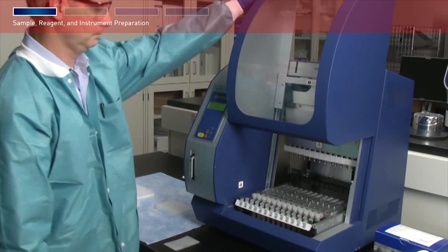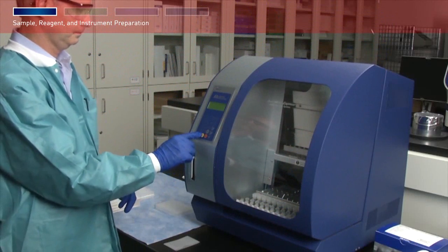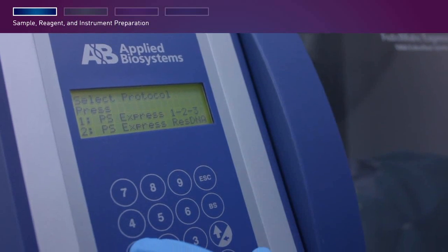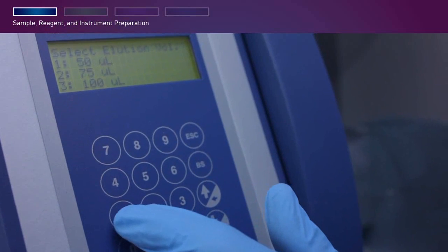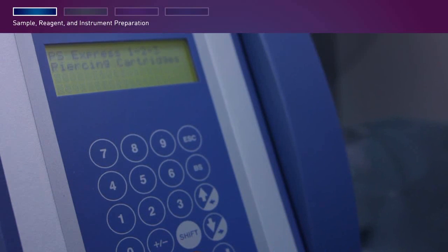Close the instrument door and press Enter. The system will then walk you through the protocol setup. Press 1 to select the PrepSEQ 1-2-3 option for mycoplasma, MMV, or vesivirus. Press 2 to select the PrepSEQ option for residual DNA. Select the lysis time, select the elution volume, then review your selections and press Start. The screen shows the steps and the appropriate runtime remaining.